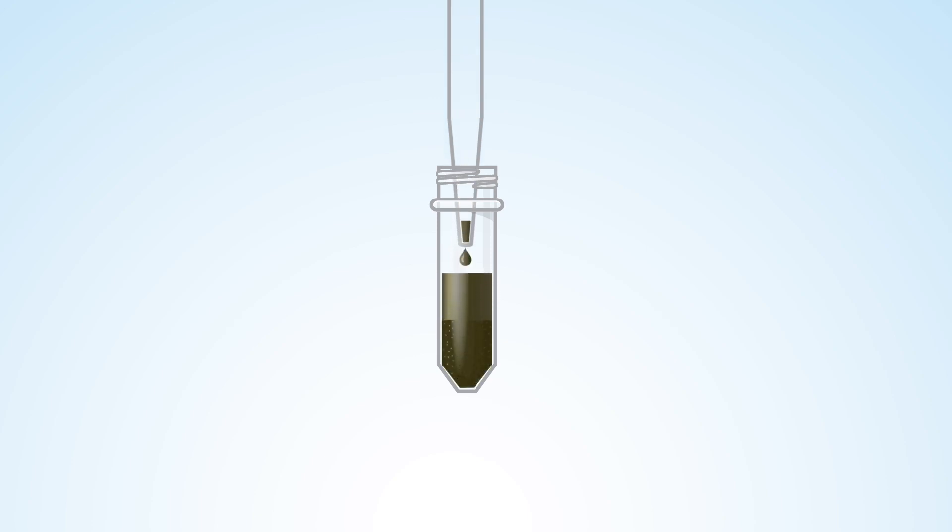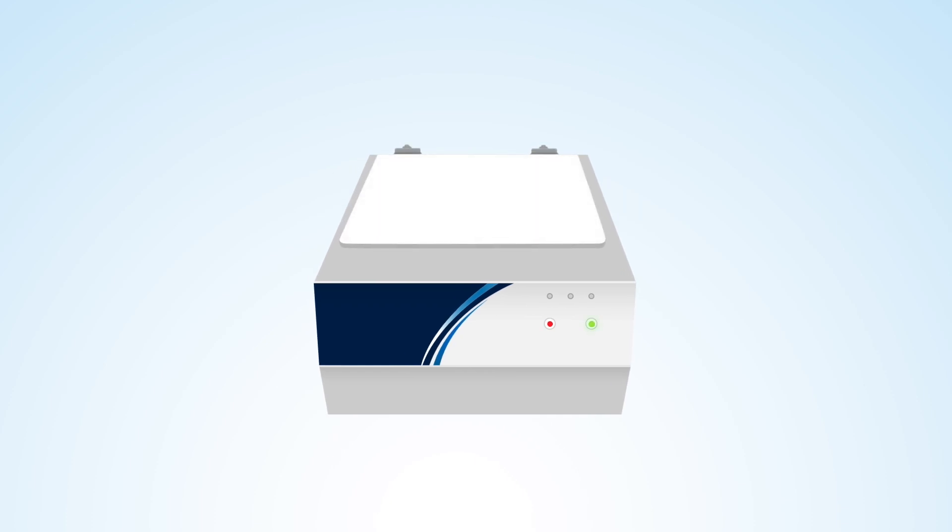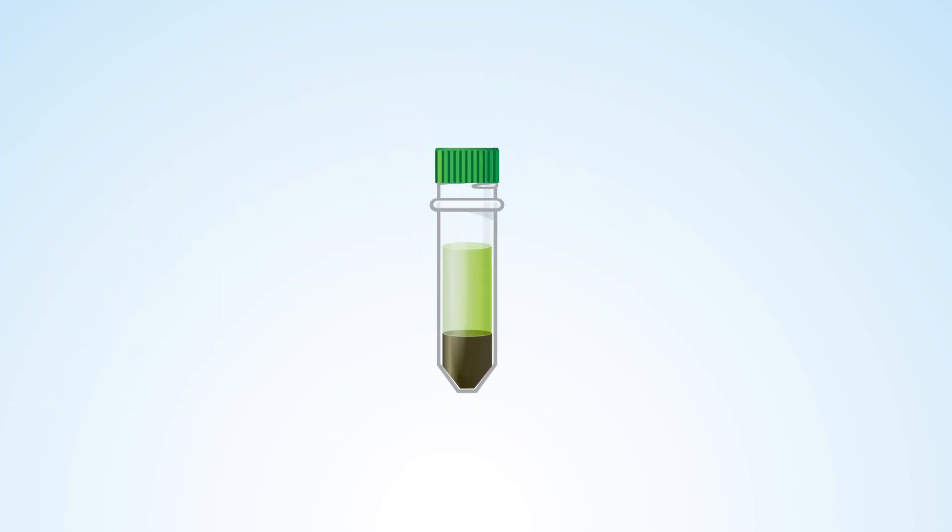Add your supernatant to the DSPE tube, shake vigorously, and then place it into a centrifuge. Once centrifugation is complete, transfer the supernatant into an auto-sampler vial and make any final adjustments required for your sample.